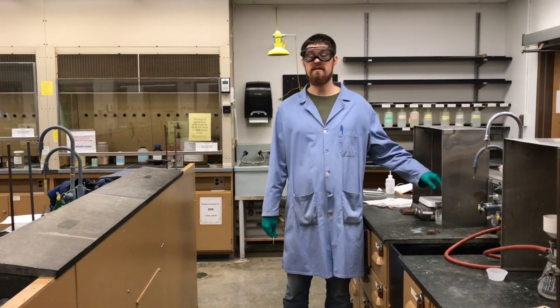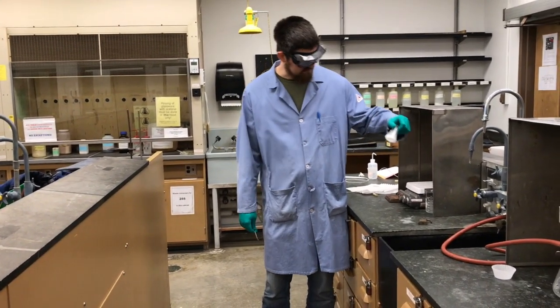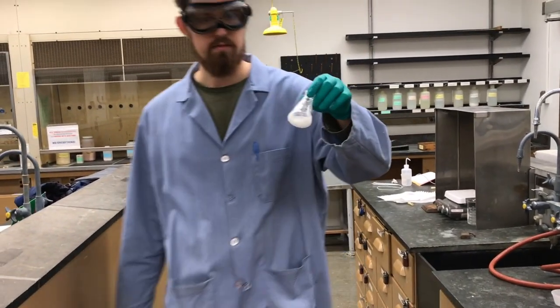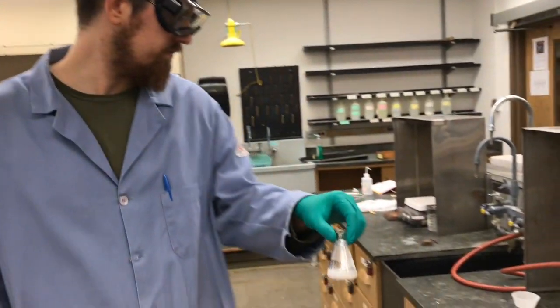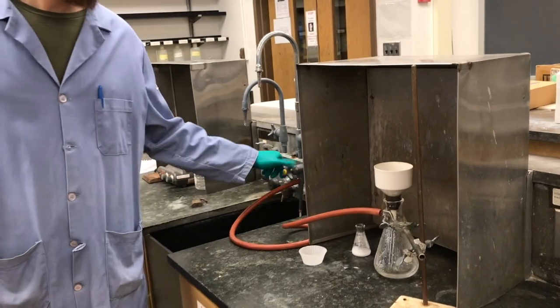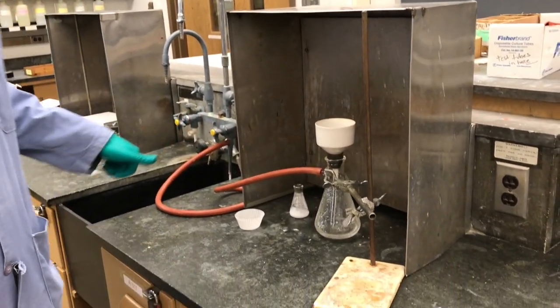So it's been about 10-15 minutes, so there's a nice solid that we can see of our purified product. So I'm going to set up the filtration, and then we'll do the ferric chloride test.